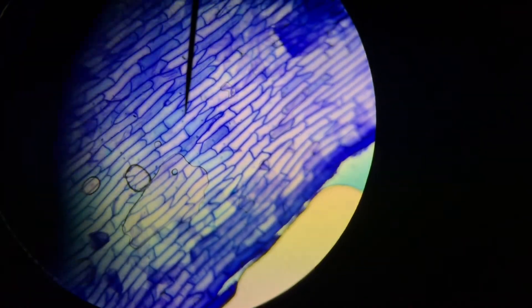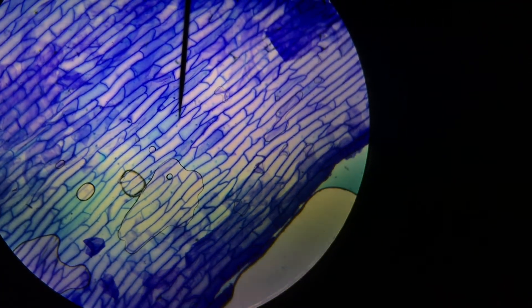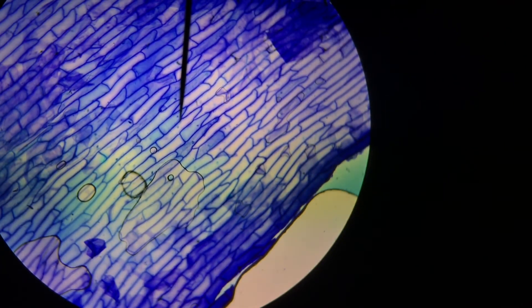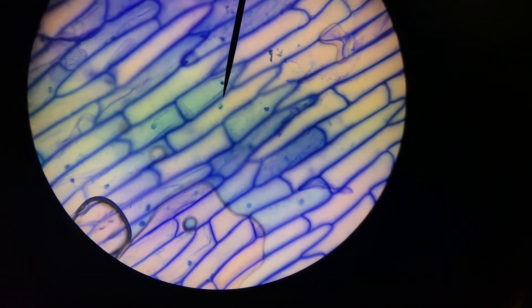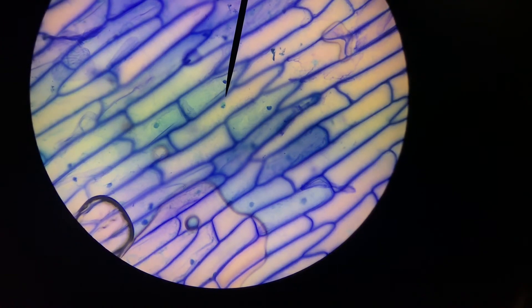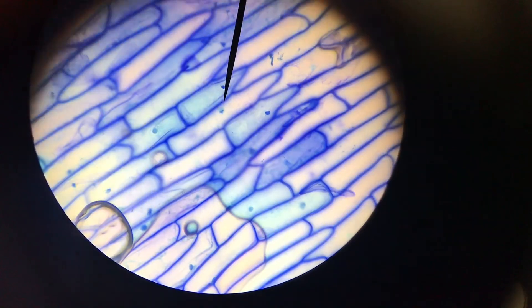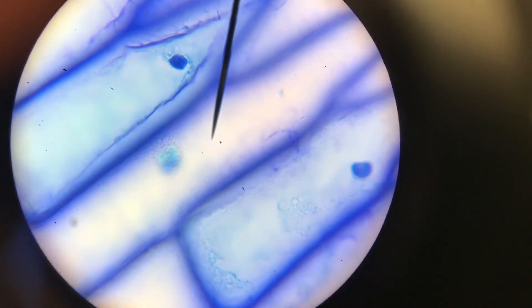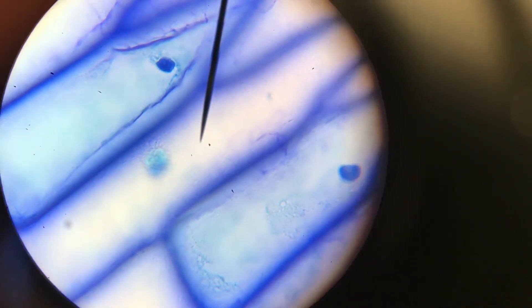Under the lowest magnification, this is what your onion cells should look like. If you look on the lower left, you can see bubbles — those bubbles are not cells. Under medium magnification, this is what your plant cells will look like; if you look closely you can see various organelles. Under high magnification, this is what your onion cells should look like, though this is not the clearest image of these cells.